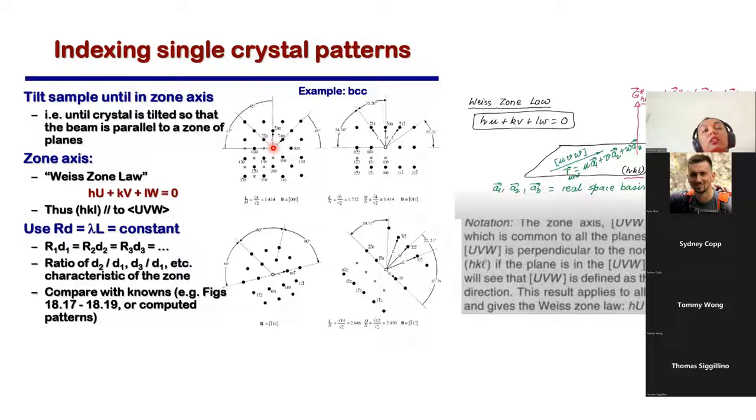And there is a lot of analysis that you do to make sure that what you see is real: you take the image of that particular feature in plus G and you take that information in minus G as well. Now, if you carefully look at this pattern, everywhere there is a plus G and minus G for each spot. So here, this is your spot where you will have two different distances. This one distance here is slightly bigger than that. So this is a pattern like this. Do not look at the cross here, only look at these solid points here.